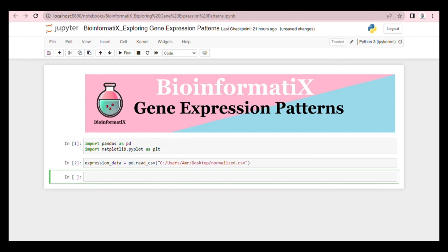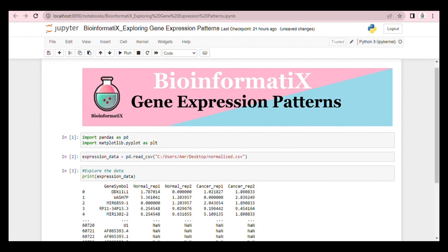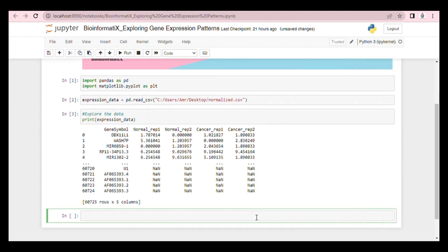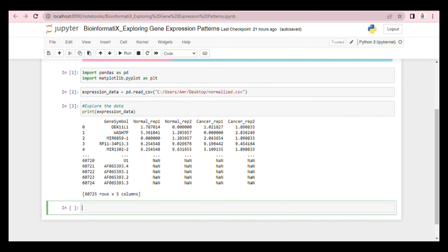Now let's explore our data. Our data consists of gene symbols followed by normal sample rep1, normal sample rep2, cancer sample rep1, and cancer sample rep2.